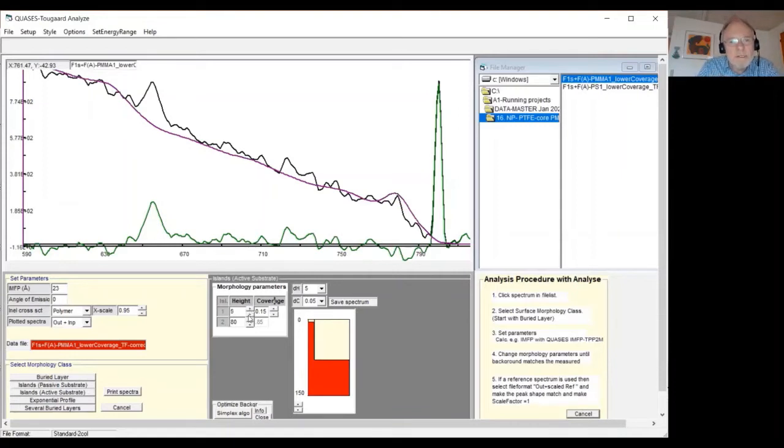It's still not perfect, but it's better, right? So probably what we have is two different coatings on the surface. One small coating and another part which has a larger coating. This would correspond to the core of the nanoparticle being off center, and then we'll have some situations where it's sticking upwards and others where it's sticking downwards, and we are exposed to the larger thickness.